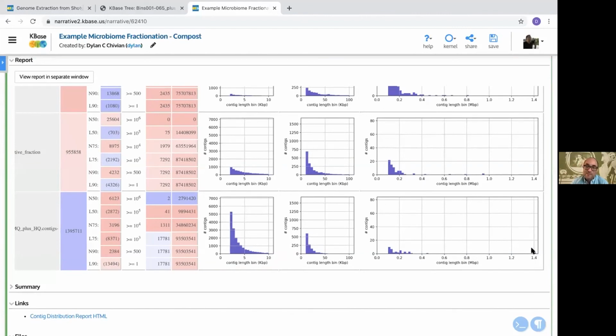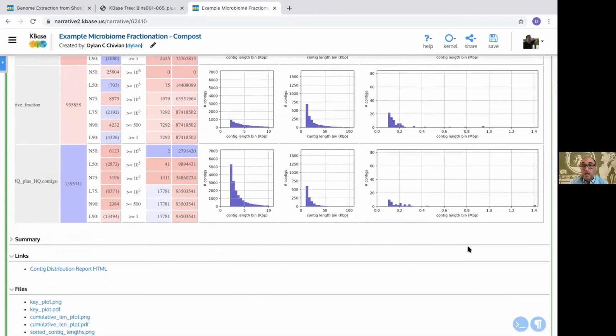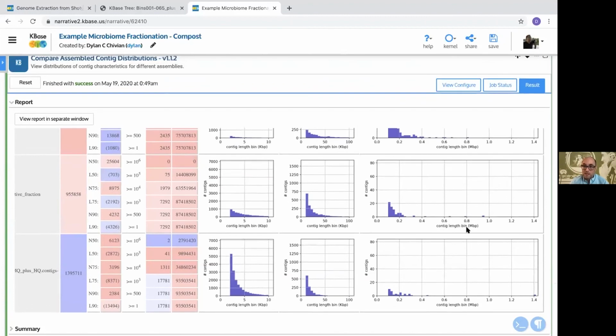But the fact is, because it got so long, the percentage of the community is probably great enough that it led to a great enough read depth for a long assembly, and you would expect there to be other contigs that also arose, and so there should be more of that lineage genome that came out. So my guess is contamination, and it's a chimera. That's my guess. Okay, so now we've split up the contigs.